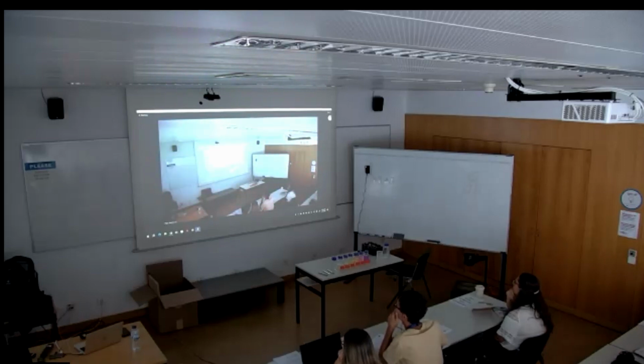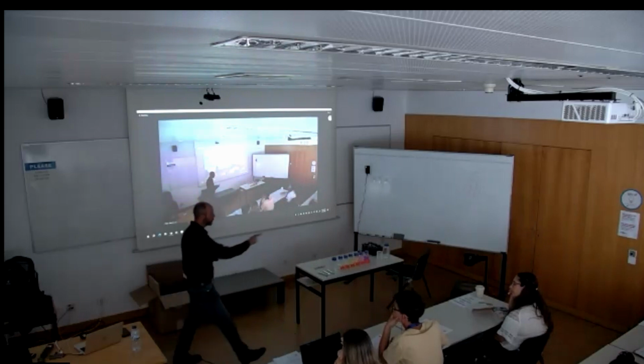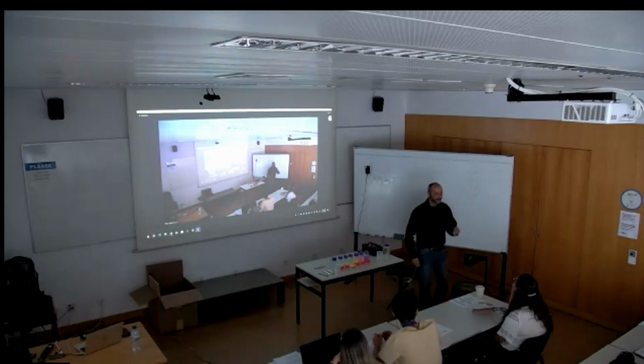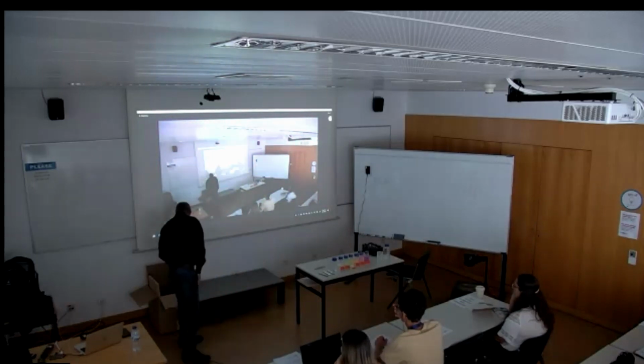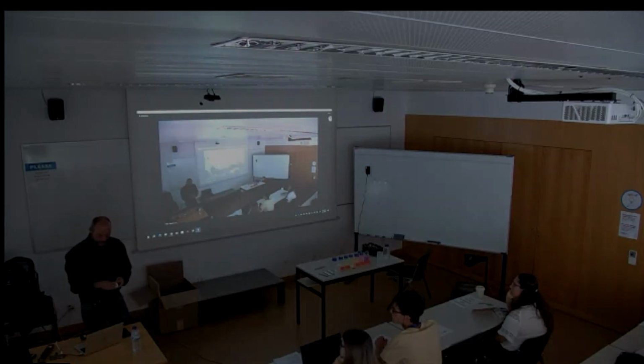There are two observations that need to be made about this demonstration. The first observation is that we do not generate this, although I know that somebody thought about it. We do not generate this, although we are placing an obstacle in front of the light. So the light doesn't diverge, and it doesn't create a shadow behind the object. This is a property that is typical of water and waves.